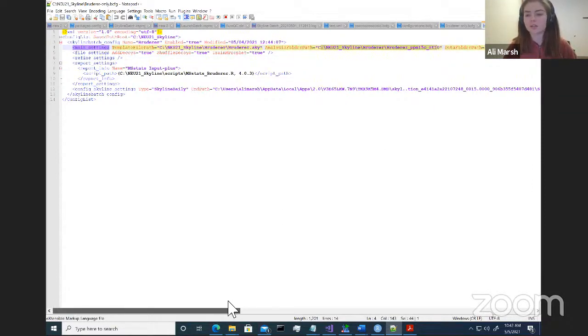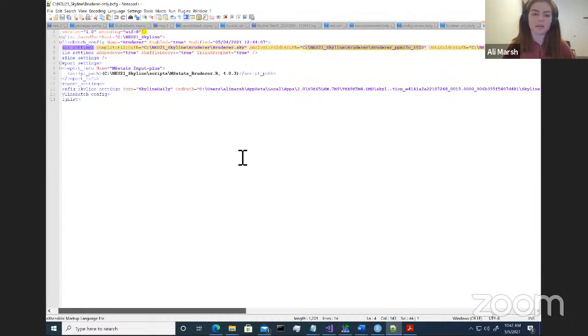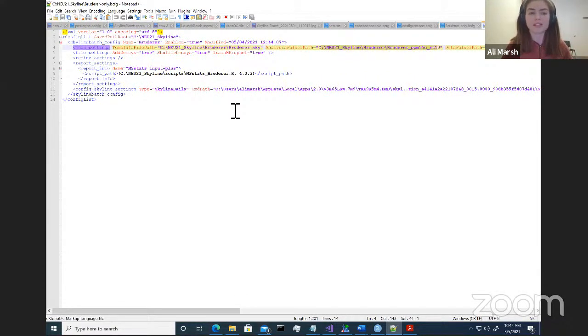This is what you could share between computers to have your friends run your configurations. Skyline Batch actually does some pretty cool path replacement that allows it to replace the root of any path on a different computer, so it can be pretty nice to share configurations between computers. We'll see that in just a second when we import our configurations for today.